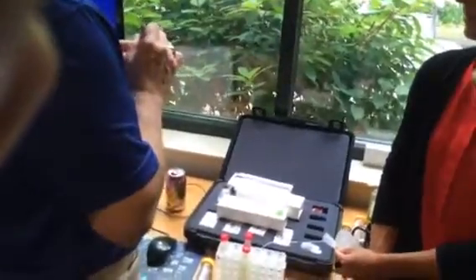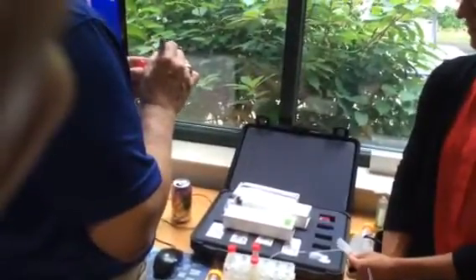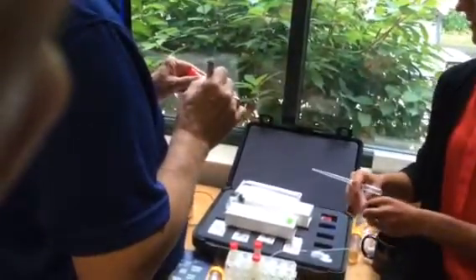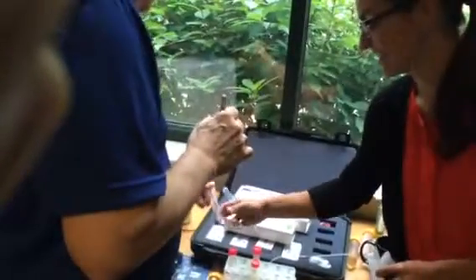Bag C, and this is going to be filtered with a 100 micron filter. Is there anything else we need to mark on that? Not for my benefit. I can't think of anything.